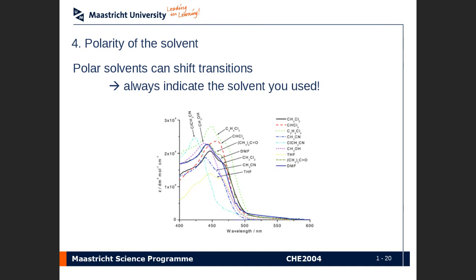And you can see clearly in the spectrum, you have more or less the same form of the spectrum in roughly the same region. You have between, let's say, 420 and 470 as the region of absorption, but you can see that shifting left and right.